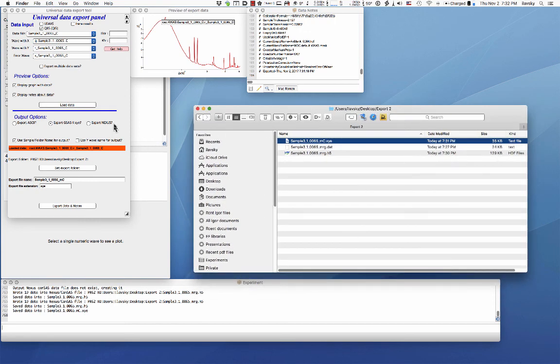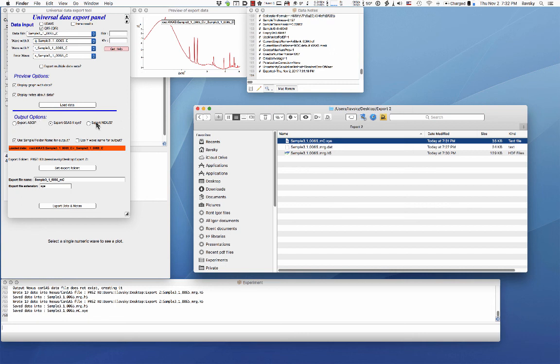Okay. So by now I should be done with this. You now see that there are various ways to extract the data for small angle scattering. You want to use ASCII or Nexus. If you have a software which can read Nexus, IRENA can, maybe SASFit or SASView can. I don't know about the other ones. ASCII should be relatively common.